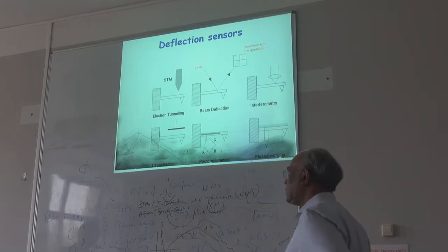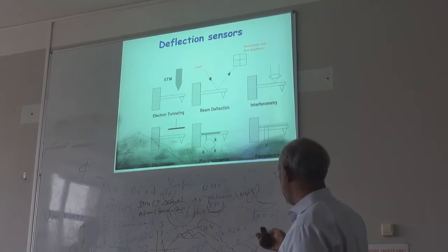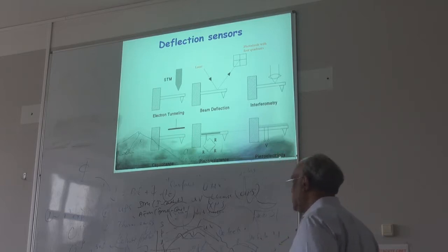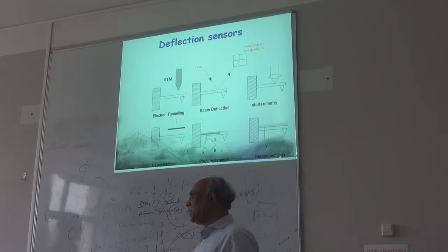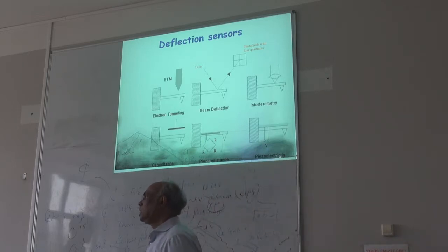And do you use these methods in your research? No, we only use the AFM, the commercial AFM using this technique. For nanomaterials? Yes. We are looking at phosphorene, a two-dimensional material. You can only see it from the AFM, easy to see. And can you see atoms? No. With AFM you cannot see atoms. You can only see the features.